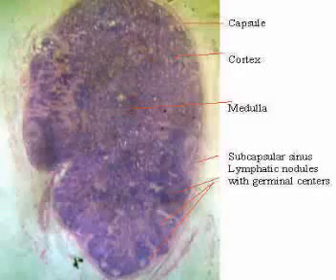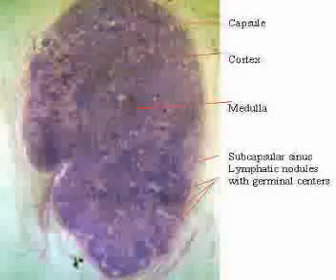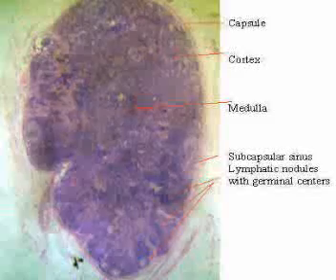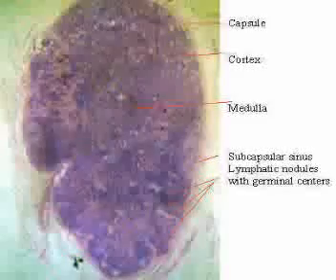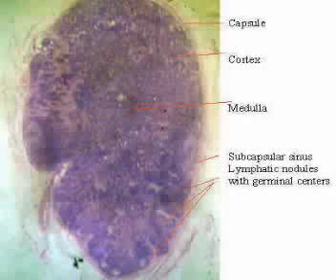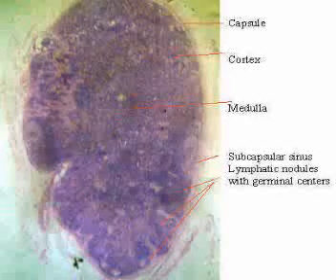A lymph node is the center of lymphocytic activity and hence has many lymphocytes. Its appearance in hematoxylin eosin stain is therefore bluish in color. It is made up of a peripheral cortex and a central medulla. The cortex contains many lymphocytic nodules whose centers are light staining, containing the germinal centers for the proliferation of lymphocytes.